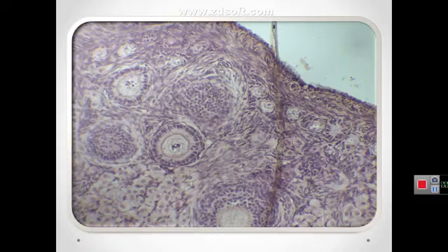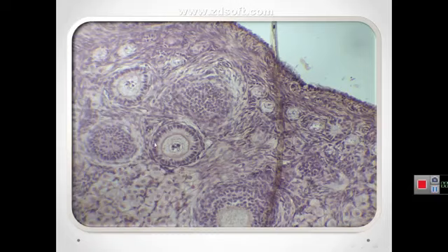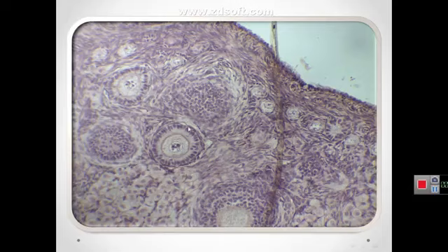Follicular cells undergo mitosis and form simple cuboidal epithelium around the growing oocyte. The follicle is now called a unilaminar primary follicle, consisting of an oocyte surrounded by a single layer of simple cuboidal epithelium. These are the follicular cells.